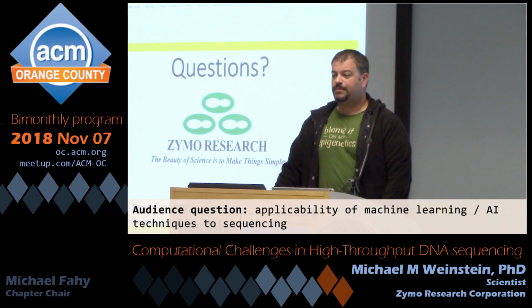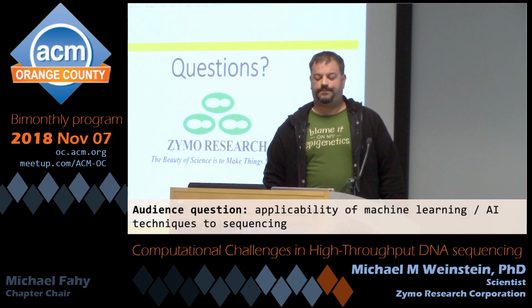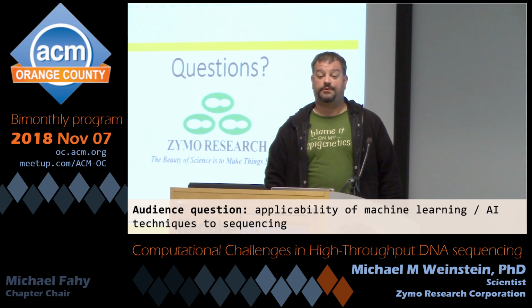Yes. As I was mentioning before about trying to find the individual variants, for example the variants that are causing cancer, one example would be looking at a read and at the context of the read, and seeing if it looks like it might be an error made by the sequencer, a sequencer artifact, or a real variant. That's something where machine learning is being applied right now.